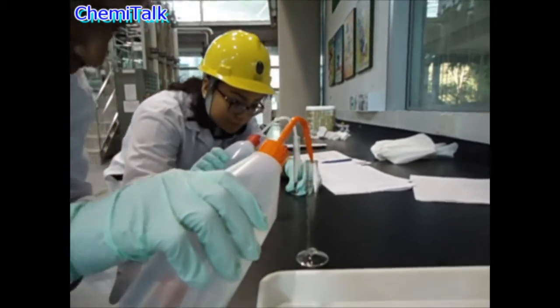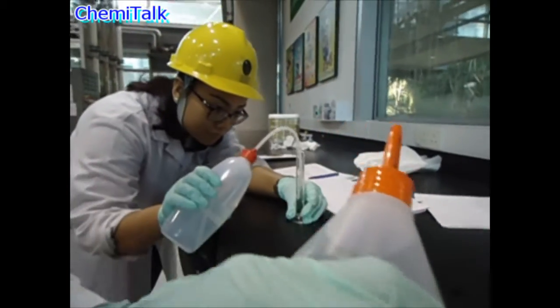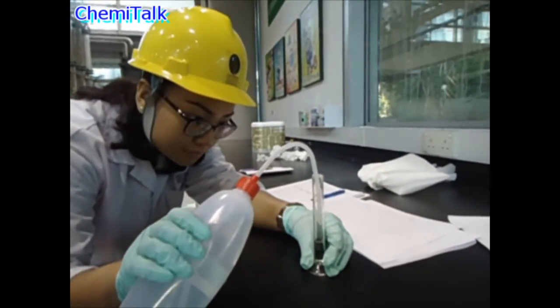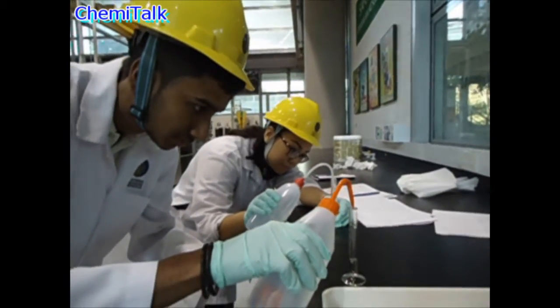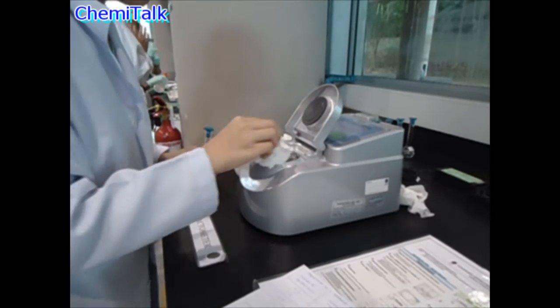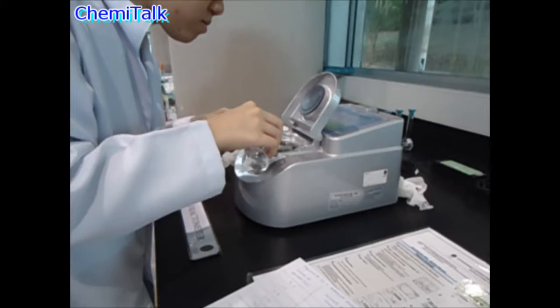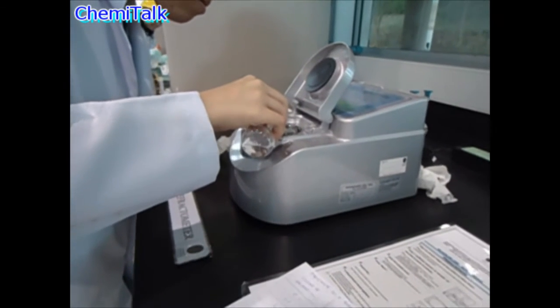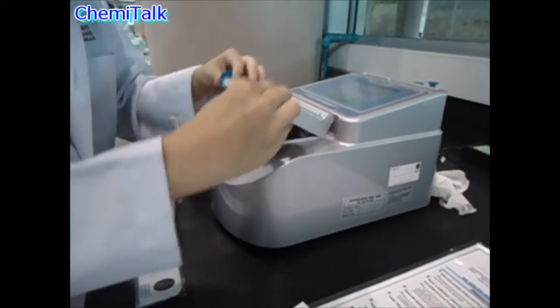As you can observe here, this is the process of preparing a mixture of ethanol and water to prepare the refractive index versus composition plot. Then over here, we have a refractometer which is used to measure the refractive index of each ethanol and water mixture that has been prepared earlier.